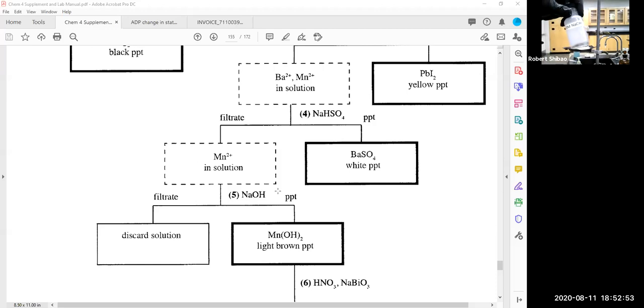So my little dropper bottle ran out, so I went to grab some more sodium hydroxide. You can see that some people spilled some sodium hydroxide on this, and as it dried, we get solid sodium hydroxide here. There's spills on this side and spills on this side. Normally when we grab a bottle, we grab it by the label, but there are 2 labels here. And so this had drippings on both sides. And if you touch that, that's just solid sodium hydroxide we're touching. Fortunately I have gloves on. And then I'll just grab it from this side here. And I'm going to refill the dropper bottle from the stock solution.